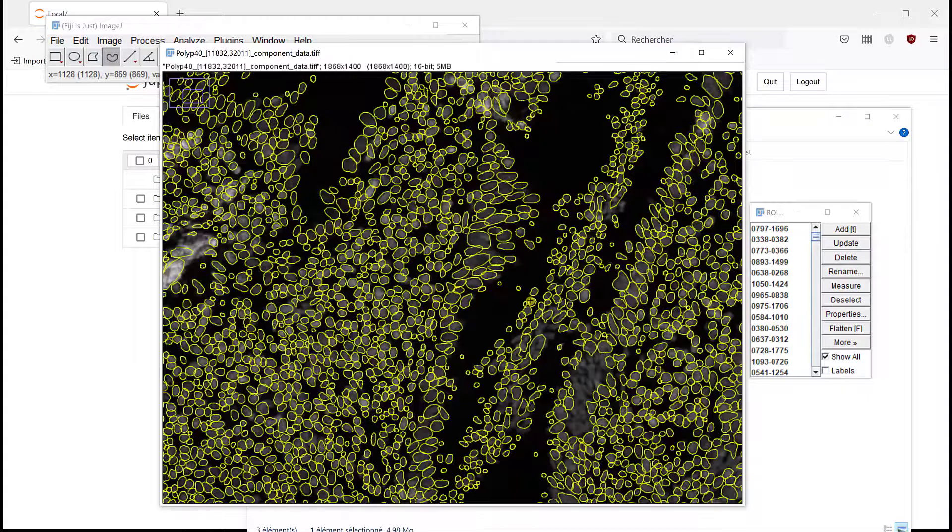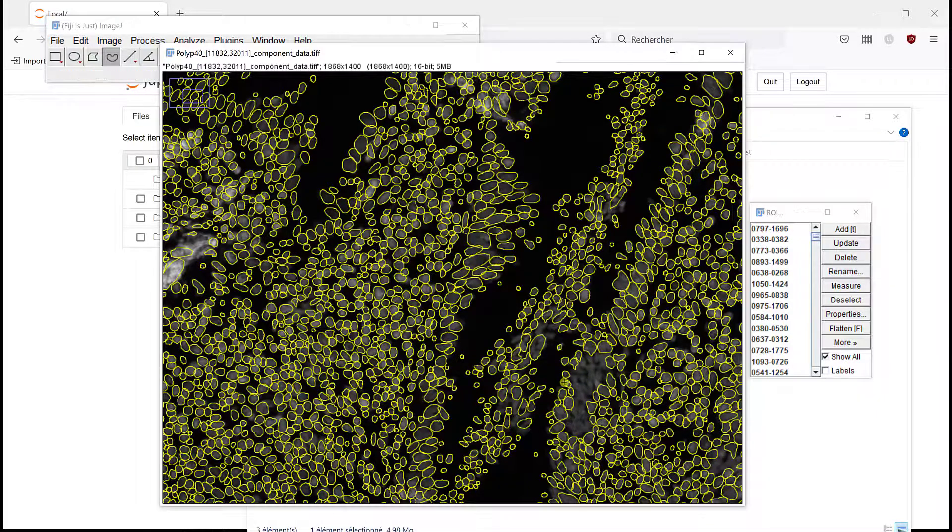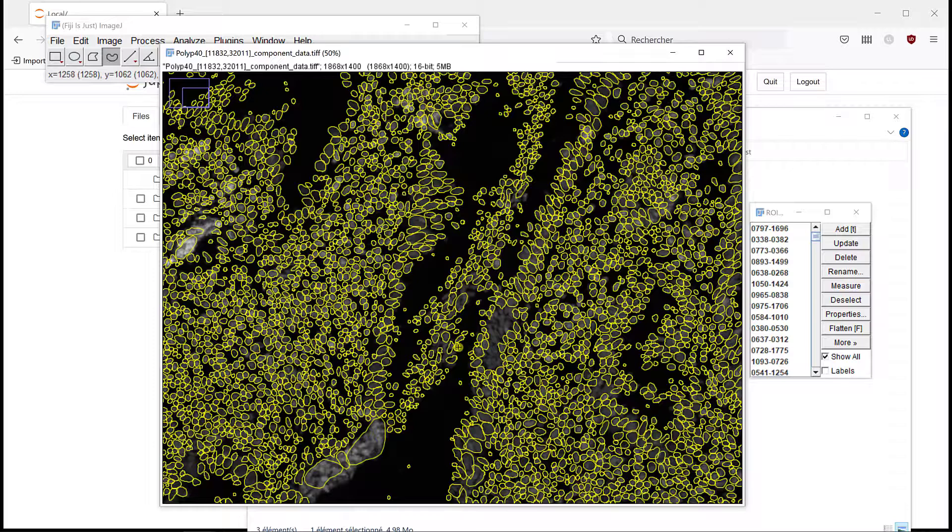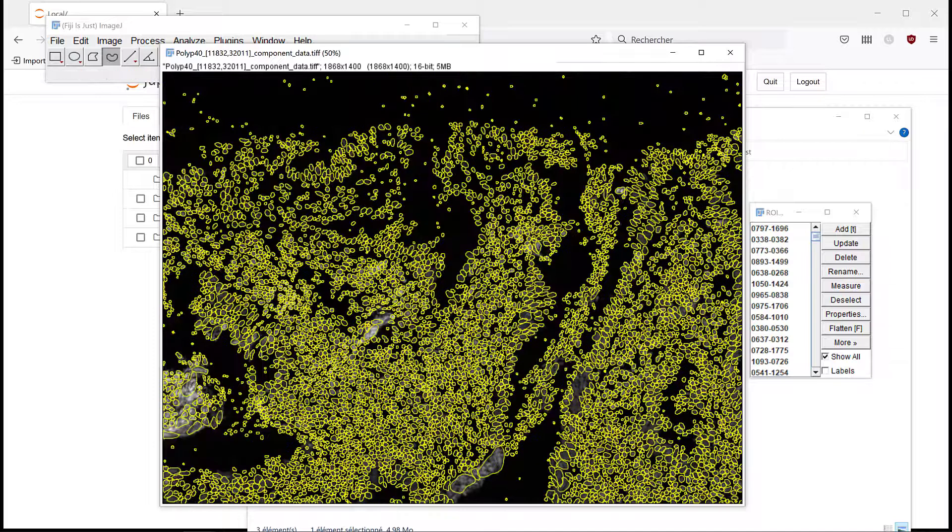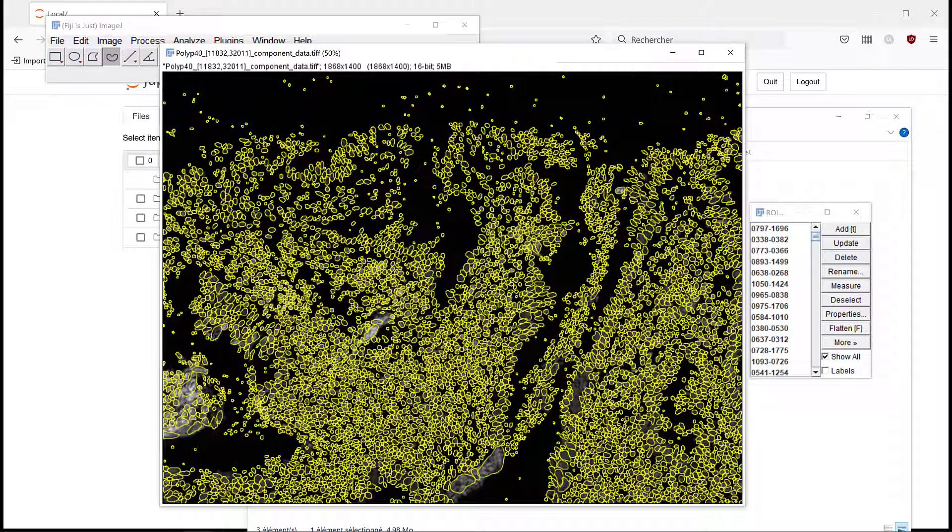Maybe with a different threshold that would work better, but here in the epithelial region again, it fails completely. So basically, to summarize, segmentation in the stroma is pretty good, but in the epithelial is not that good.